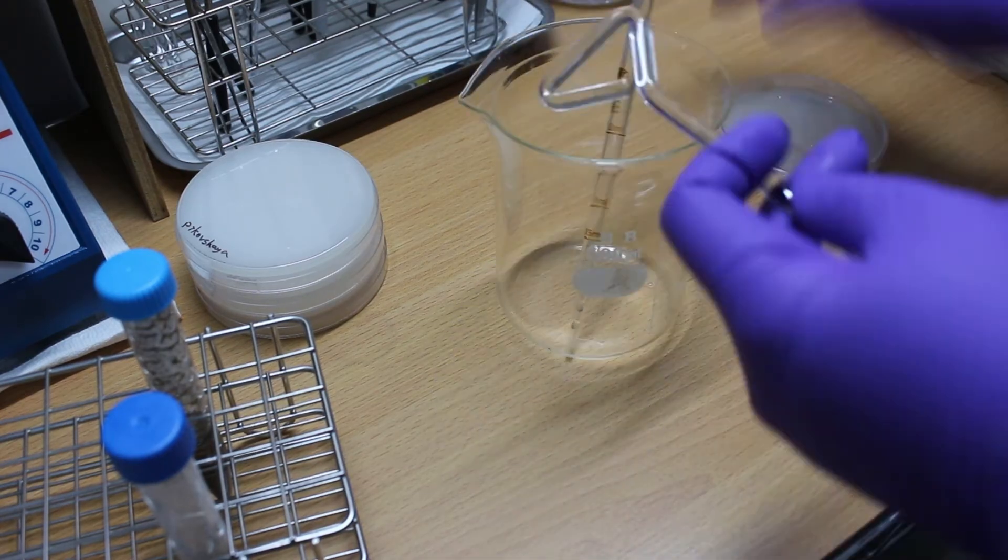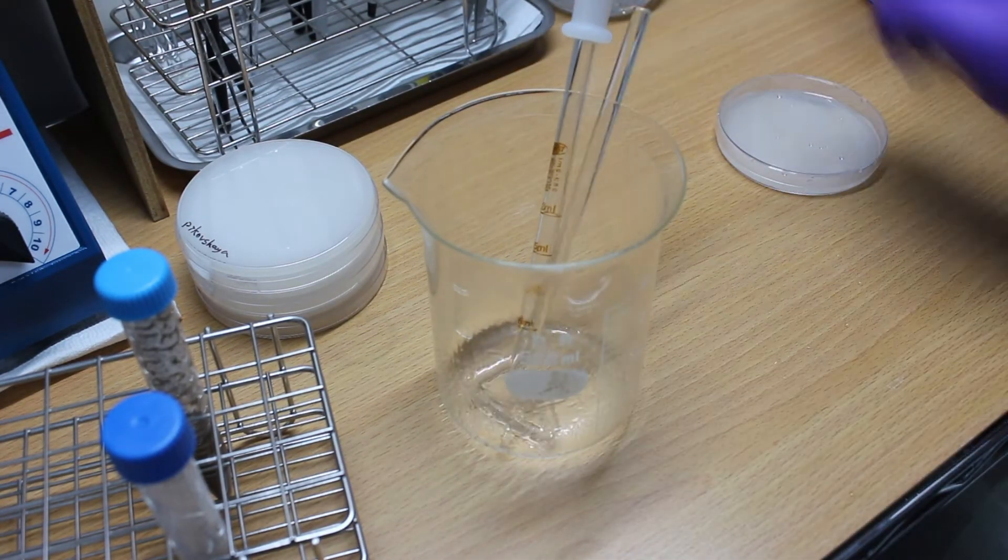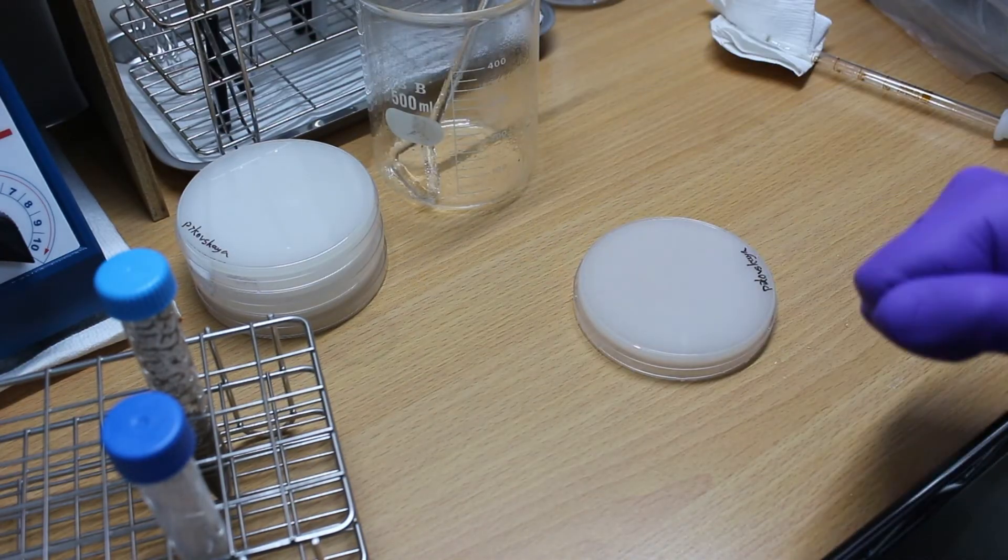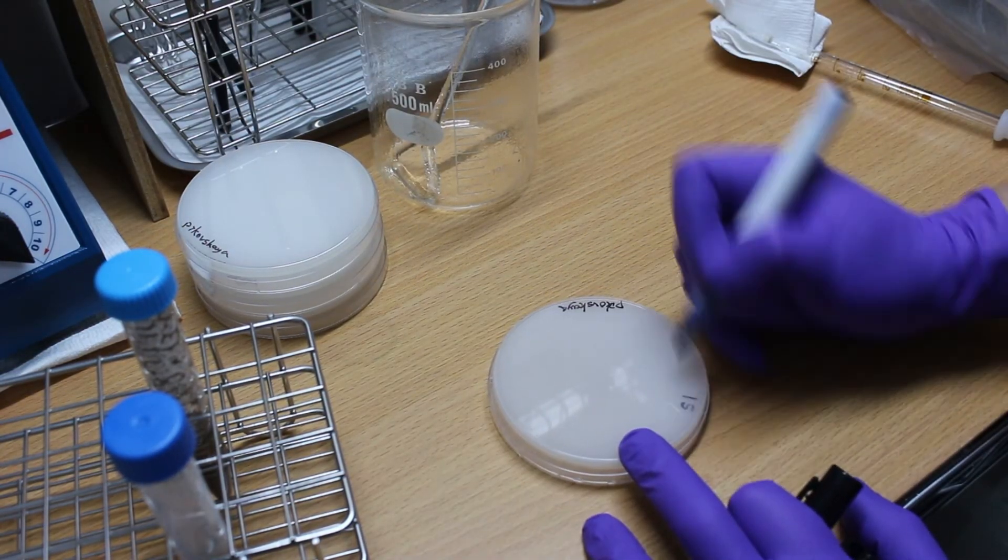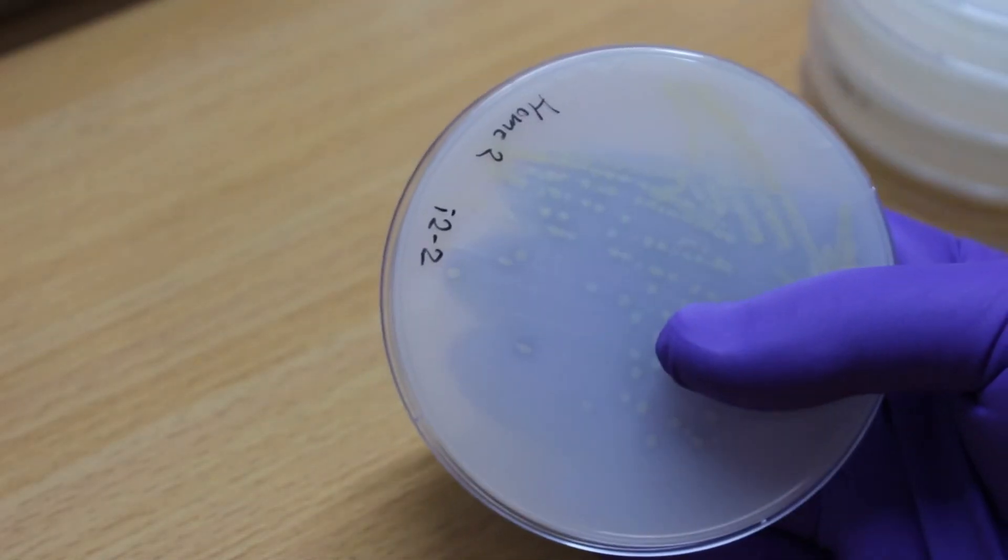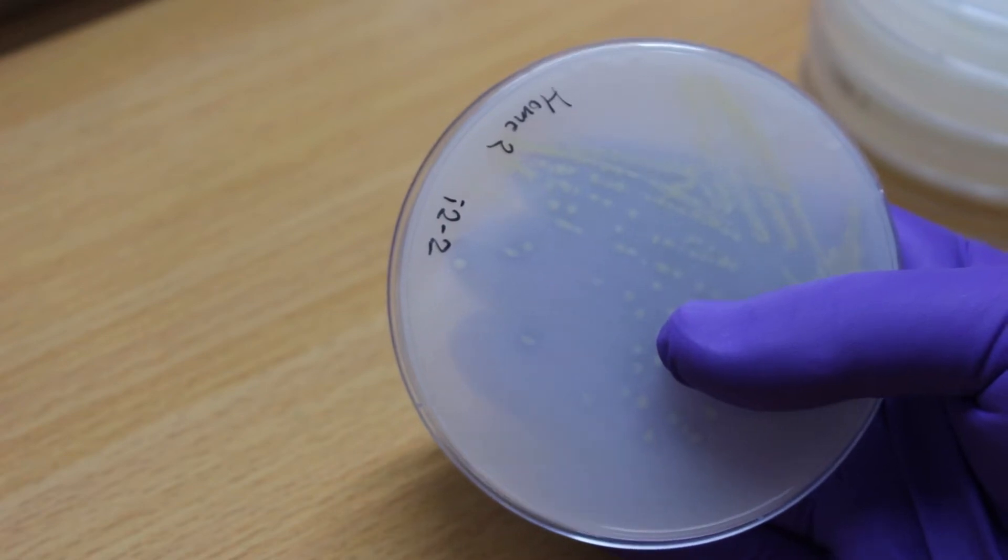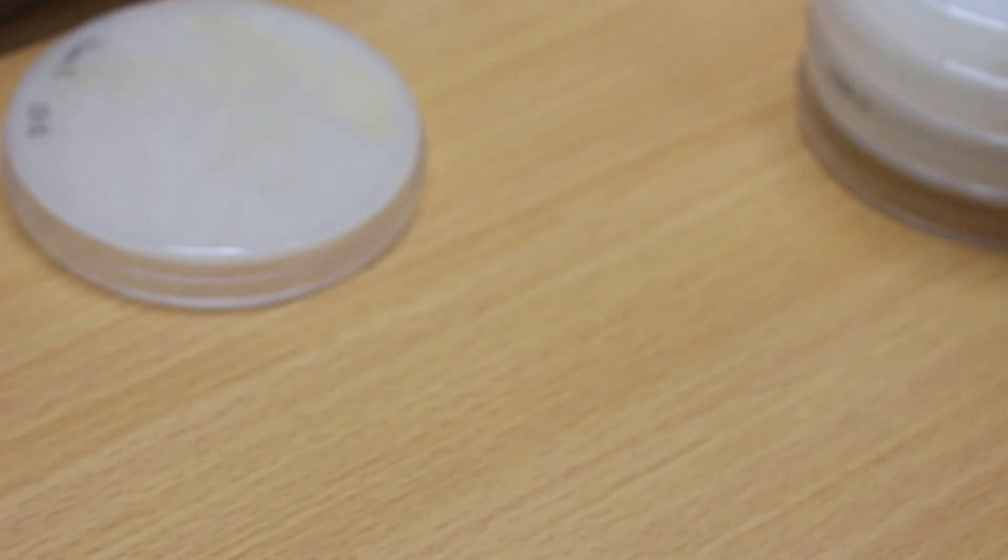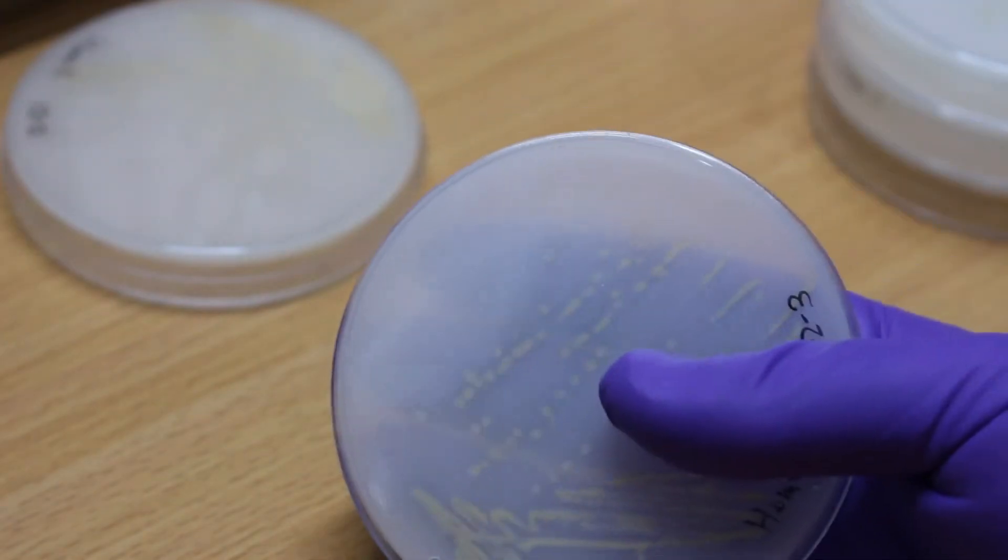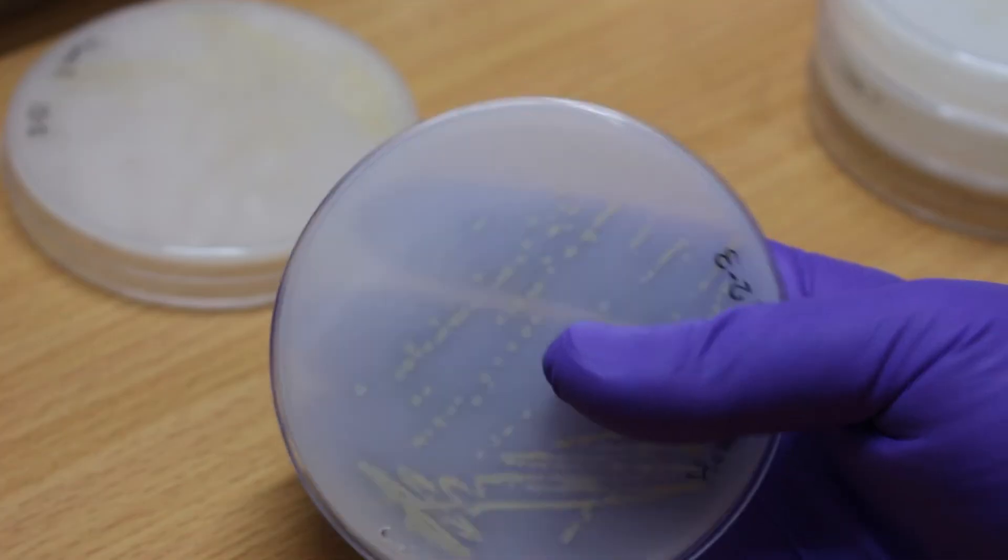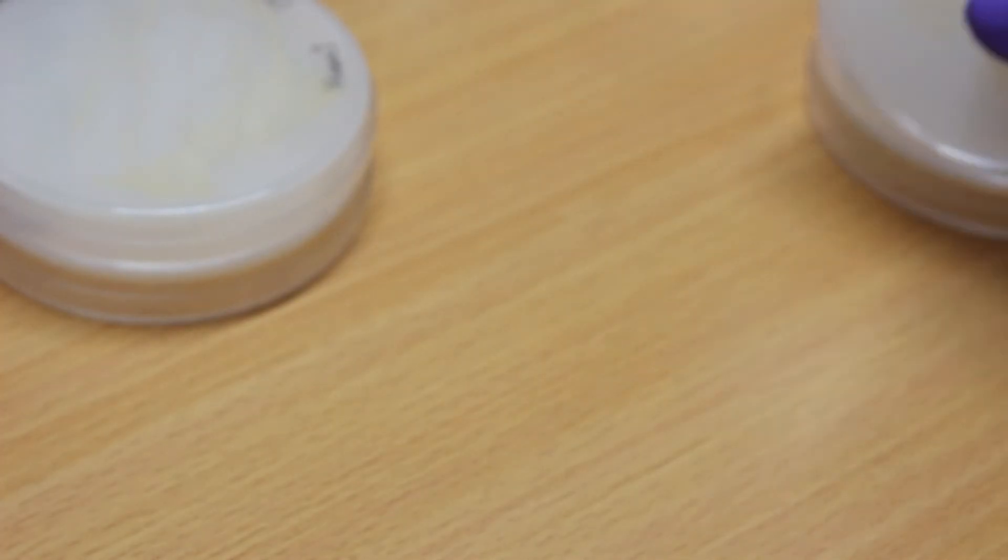During the filming process, I used about 10 agar plates for the initial sampling from the soil and found 15 suspect colonies. After screening, I was able to isolate 6 PSB bacteria. This shows that the quantity of PSB in soil, although it's not very high, is not very rare either. With correct operation, the probability of isolating PSB is quite high.